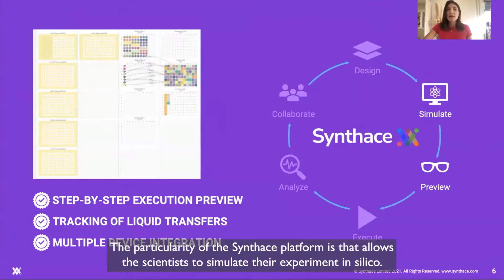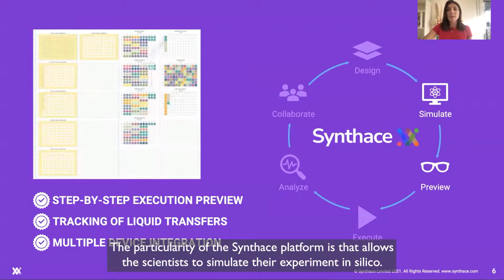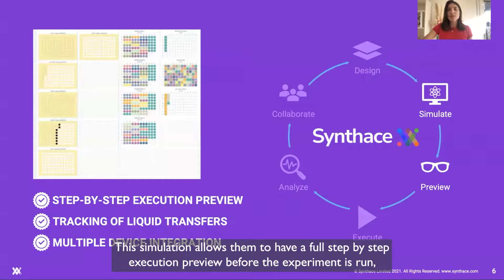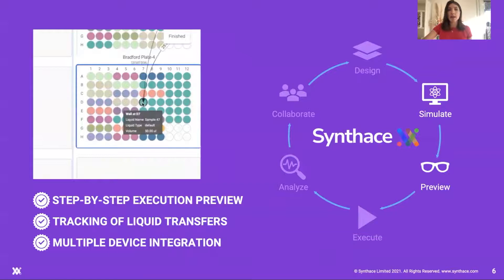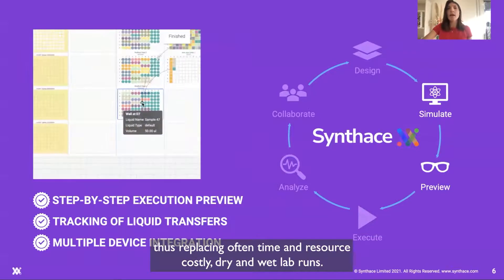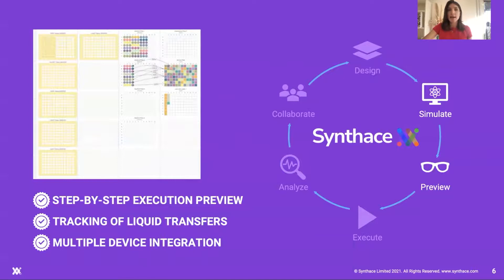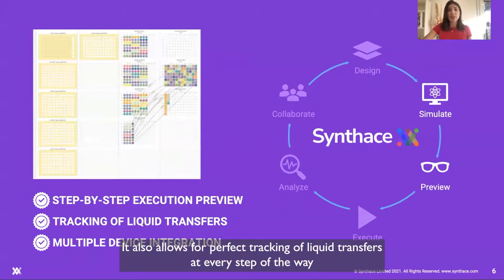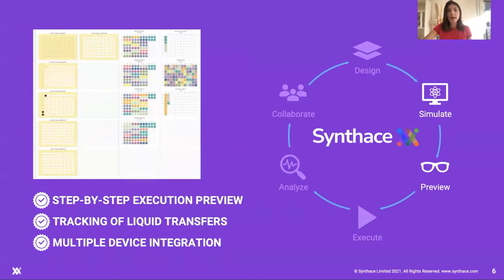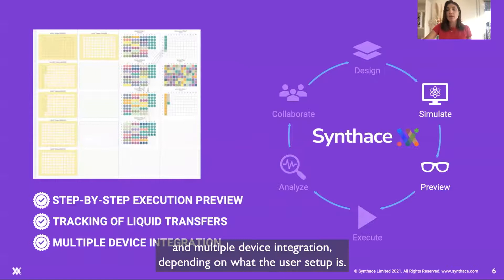The particularity of the Synthace platform is that it allows scientists to simulate their experiment in silico. This simulation allows them to have a full step-by-step execution preview before their experiment is run, thus replacing often time- and resource-costly dry and wet lab runs. It also allows for perfect tracking of liquid transfers at every step of the way, and multiple device integration depending on the user's setup.